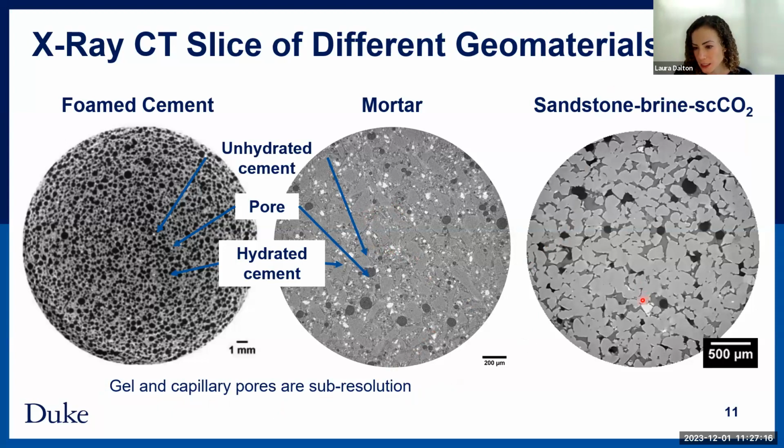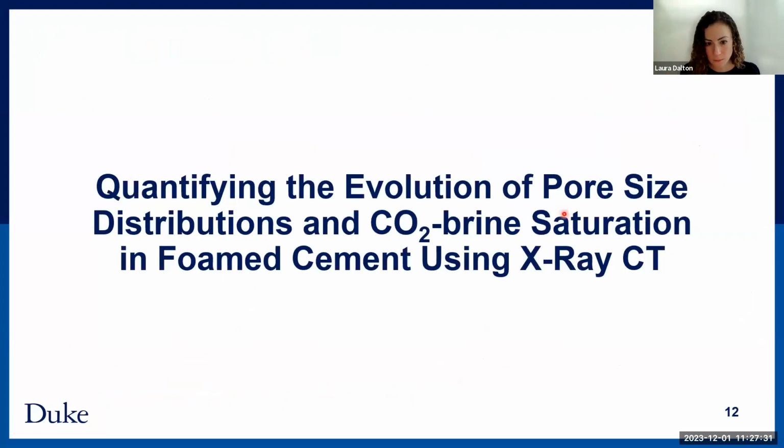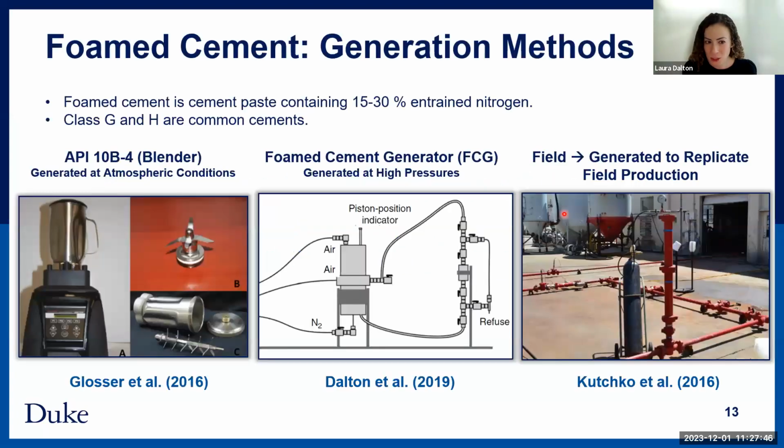And then this is a sandstone on the right, and this is supercritical CO2, and then the rest of the pore space is filled with a brine salt water to simulate what's happening underground. So I just wanted to orient everyone to what you're looking at for these. So really the first thing I ever worked on with X-ray CT scanning was to quantify the evolution of pore size distributions. And so I'm going to talk about that first.